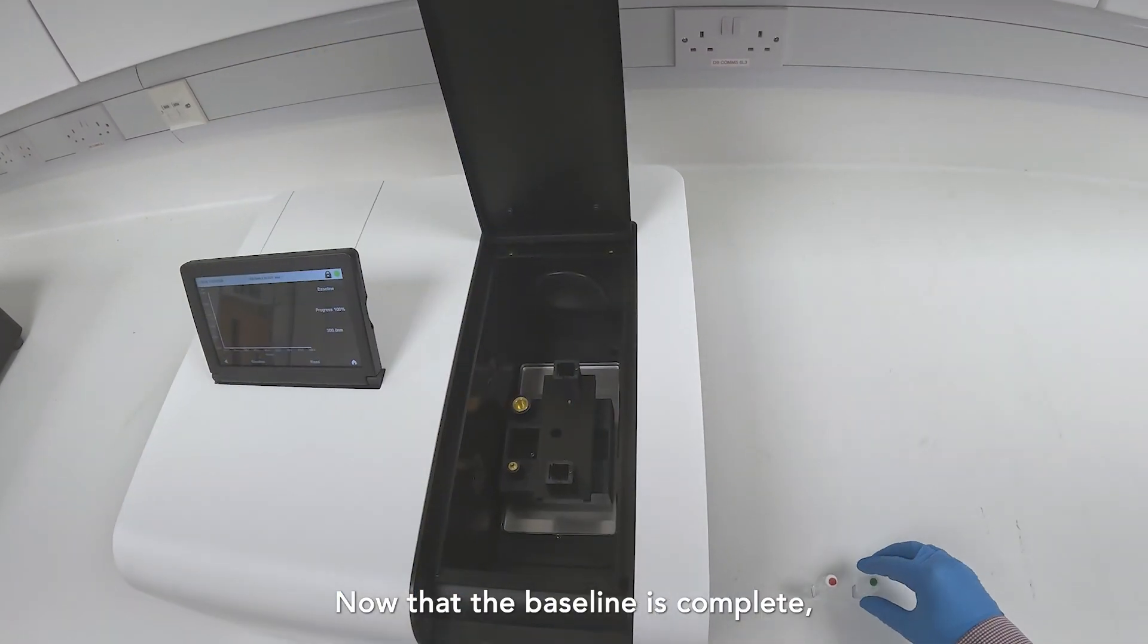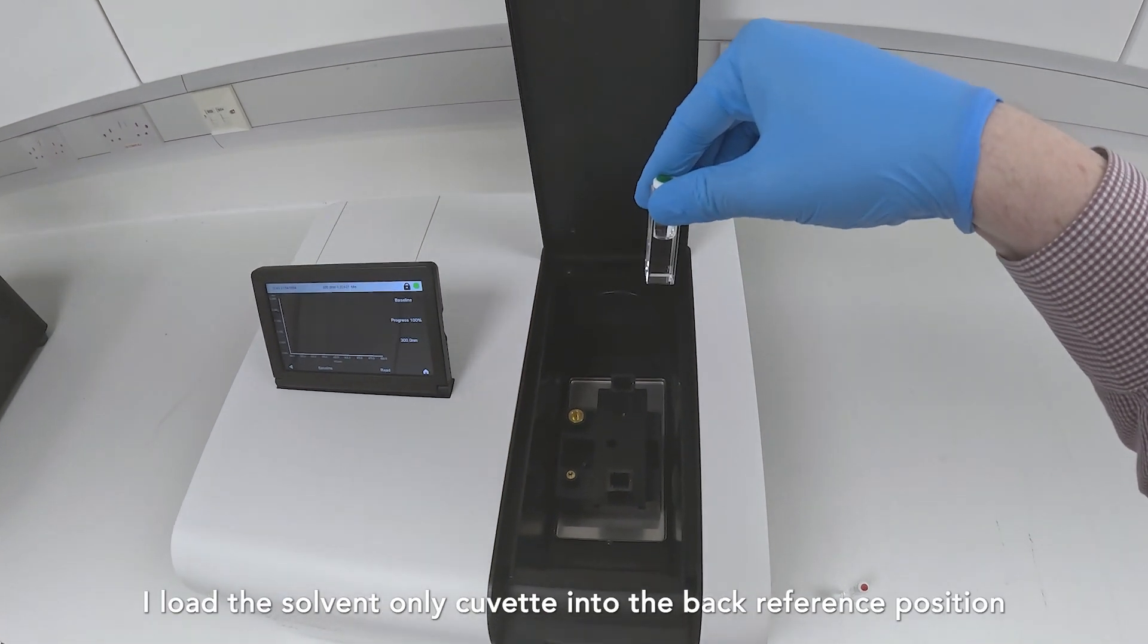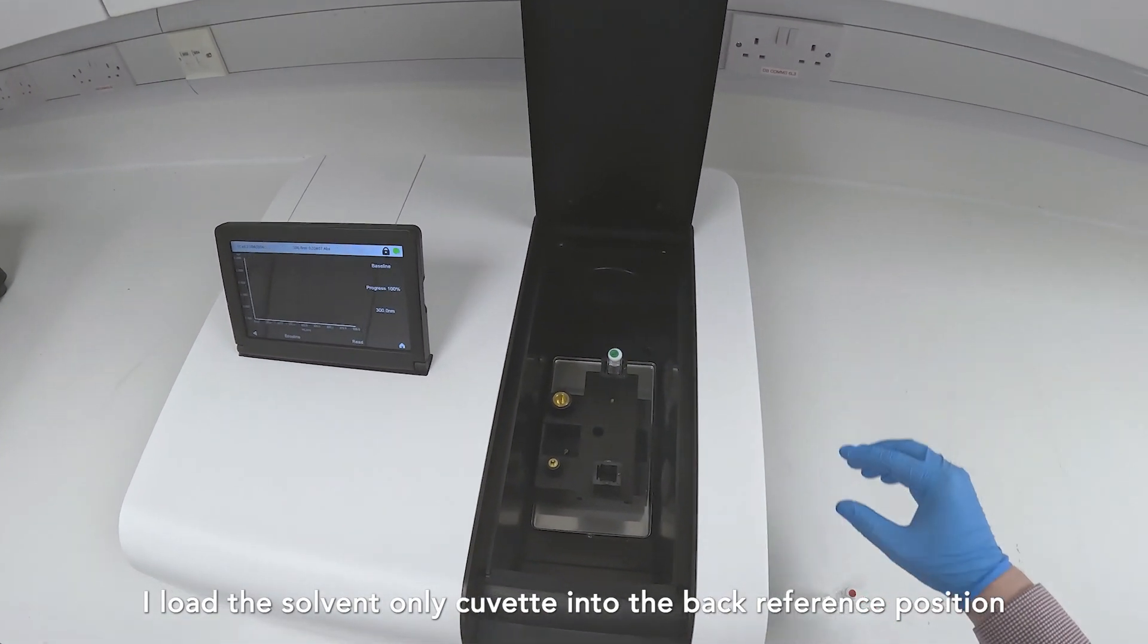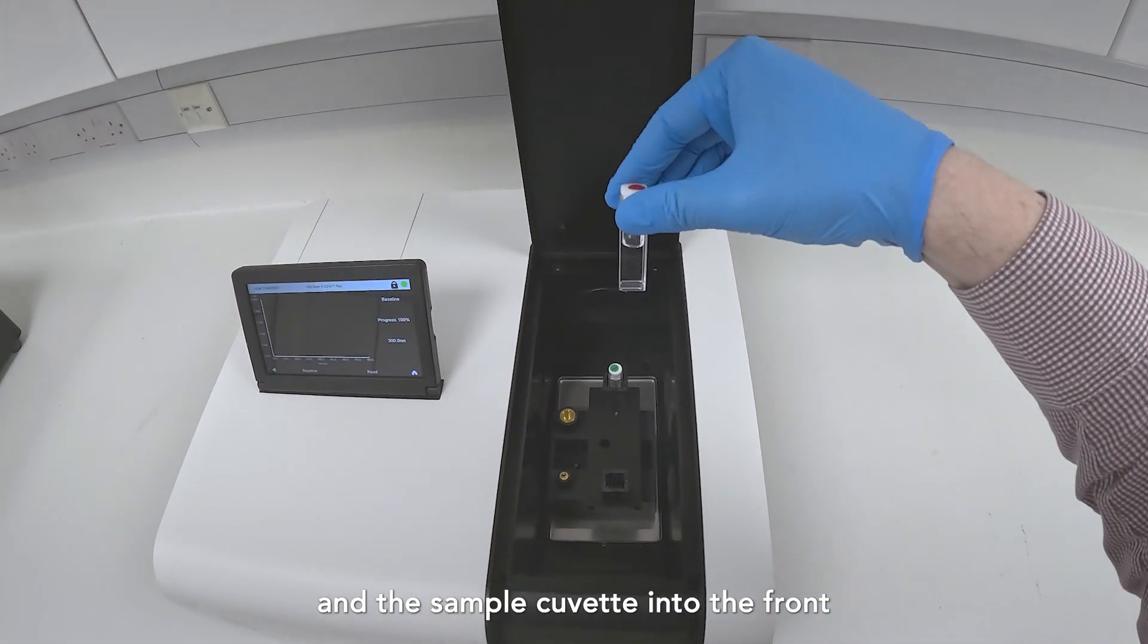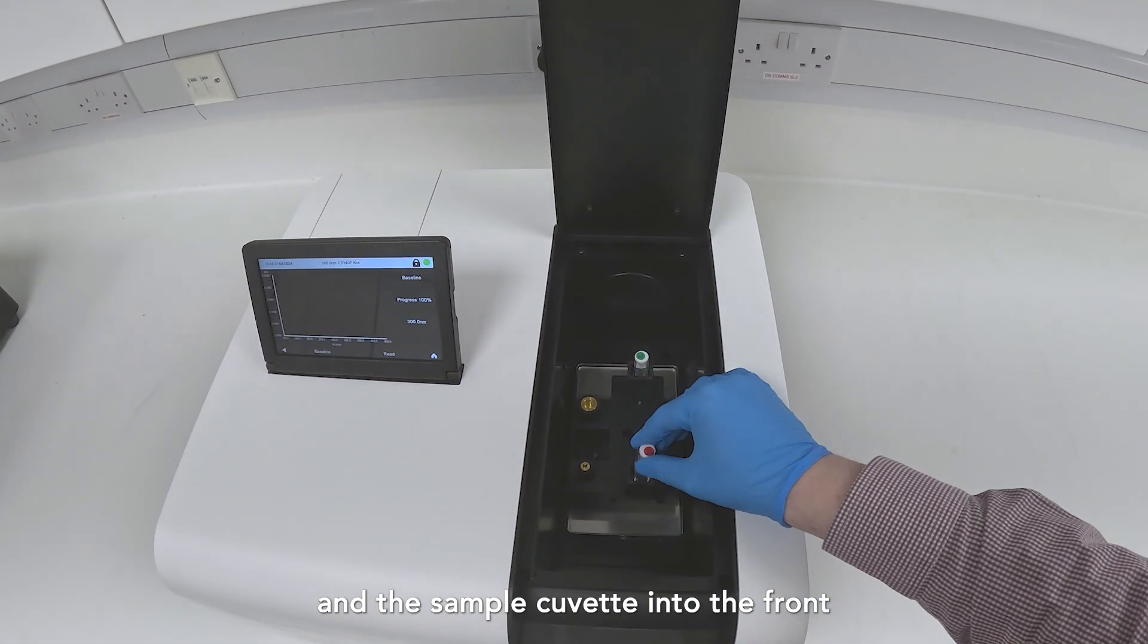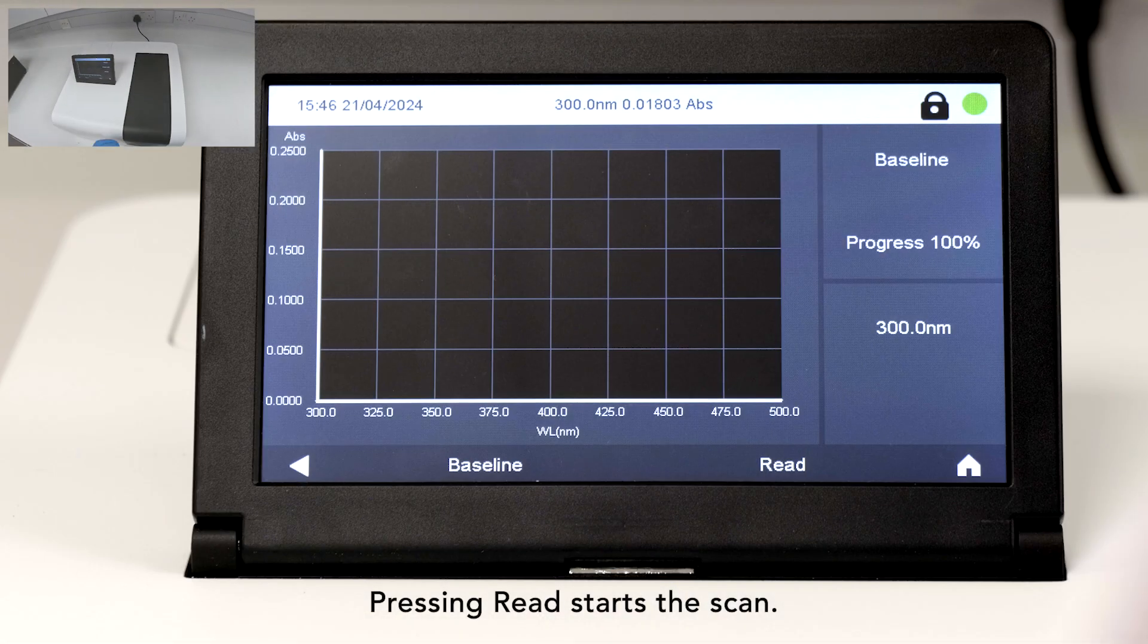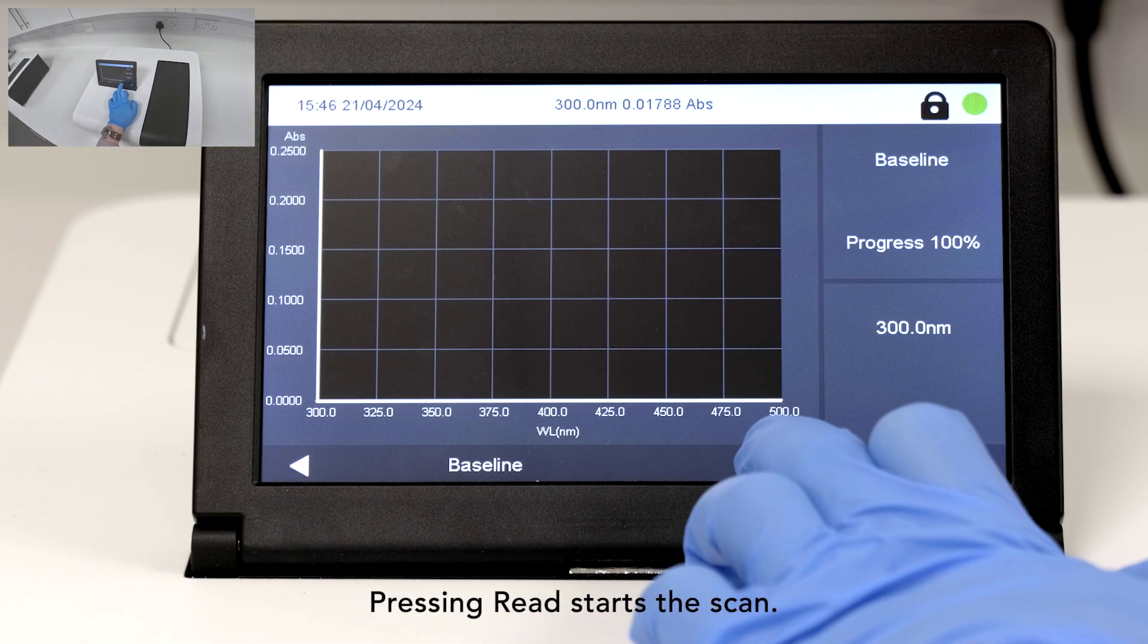Now that the baseline is complete, I load the solvent-only cuvette into the back reference position and the sample cuvette into the front sample position. Pressing Read starts the scan.